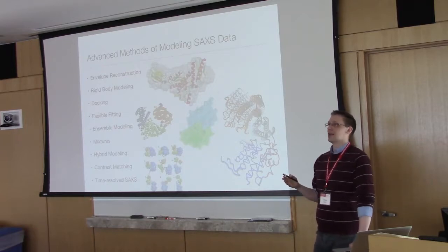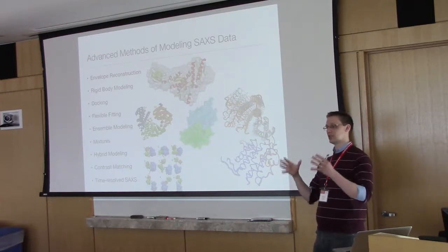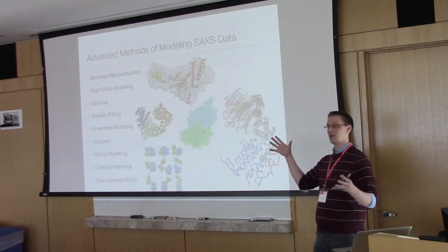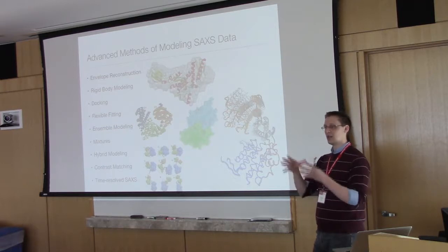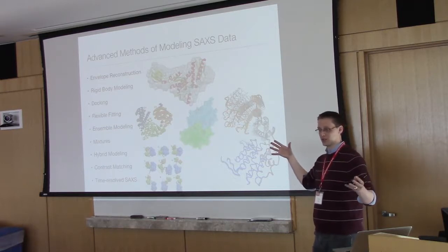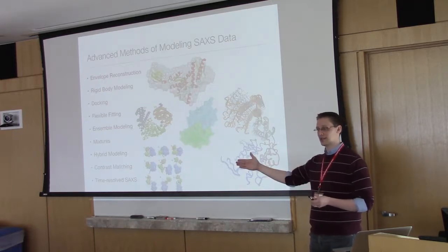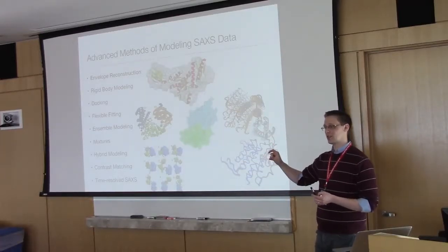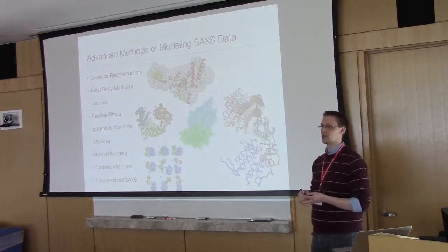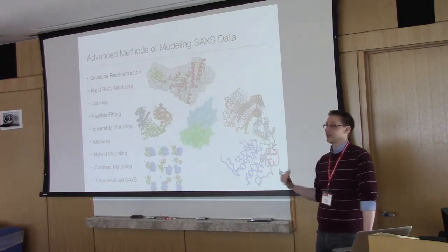If you think about it in terms of the number of parameters you need to reconstruct an object at higher resolution, it grows as the cube of the resolution. In reciprocal space, the volume goes up as the cube because we live in 3 dimensions. But the SAXS profile, if you go out to higher resolution, only increases linearly. So your observation to parameters ratio gets worse by n squared at higher resolution. You're getting that many fewer pieces of information relative to what you need.